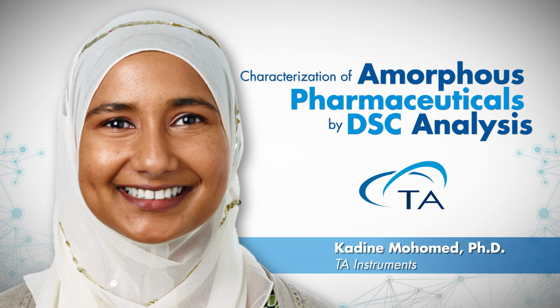Okay, thank you. I should say one last thing. You should always calibrate your instrument for temperature and cell constant. Cell constant being the response for the enthalpy or area of a peak that is calculated. The DSC should always be calibrated with your pan selection. So if you're running with alumina or ceramic pans, you should definitely calibrate with the indium standard using that pan type. Okay, great. Here's another question.